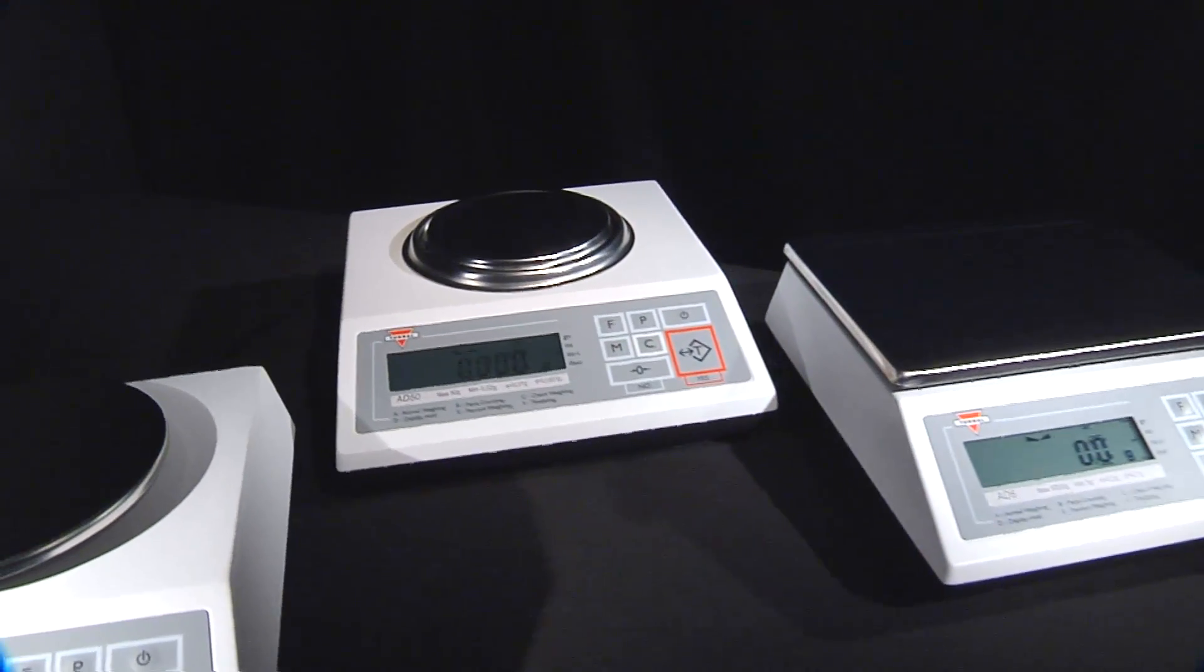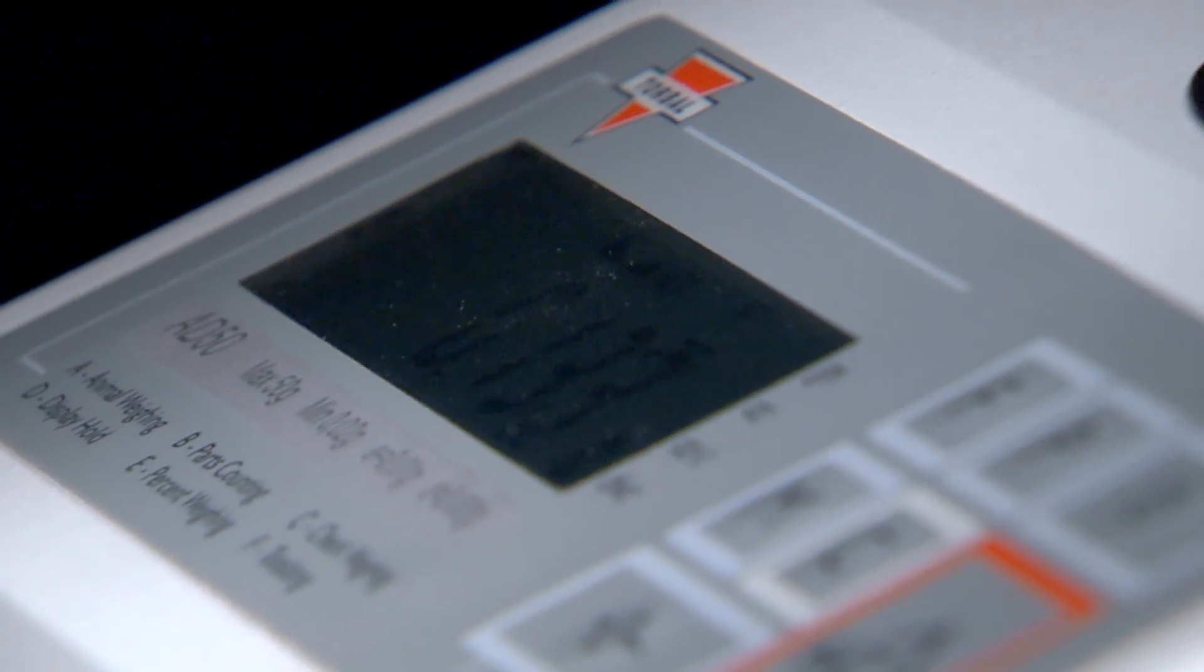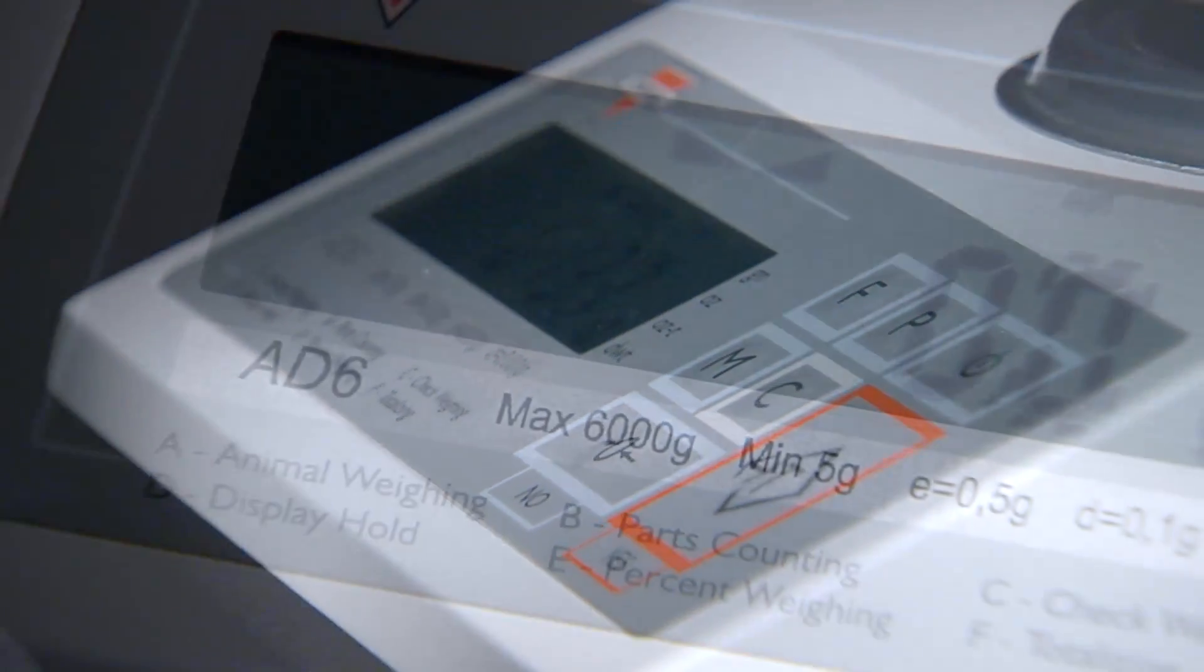All Torbal digital scales have a sealed front panel that protects the keys and the LCD display from dust and accidental spills.